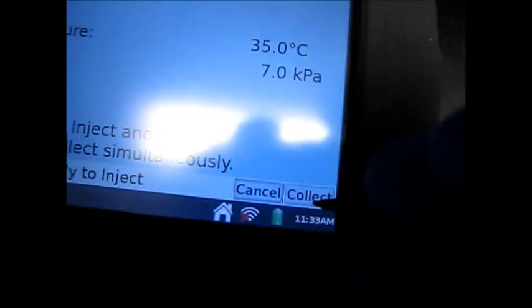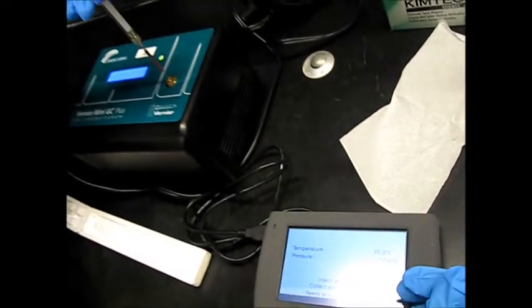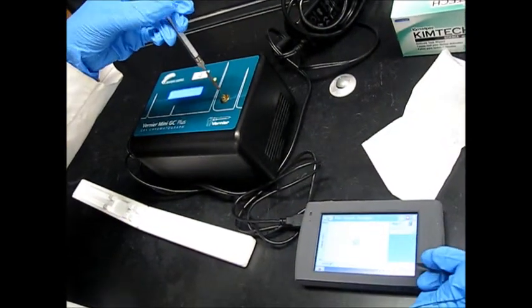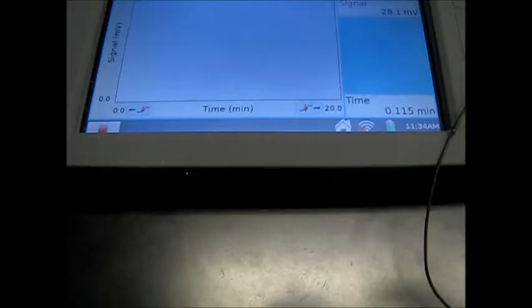Now I have to do this simultaneously. I'm going to insert and press collect at the same time. So here I'm going to press collect and I'm going to insert at the same time. So I'll do it on three. One, two, three. So I'm going to remove the needle. And the GC has the sample.